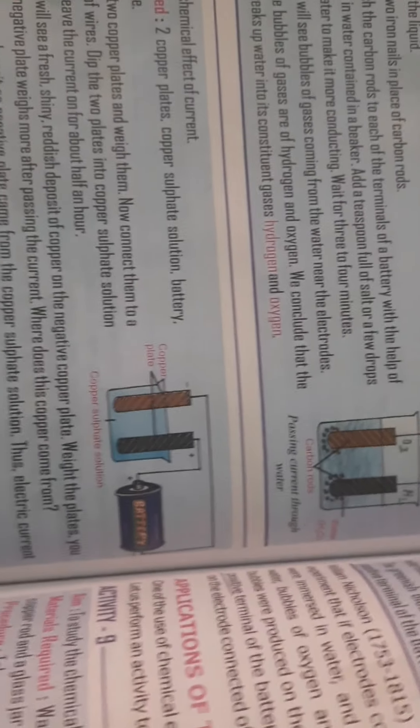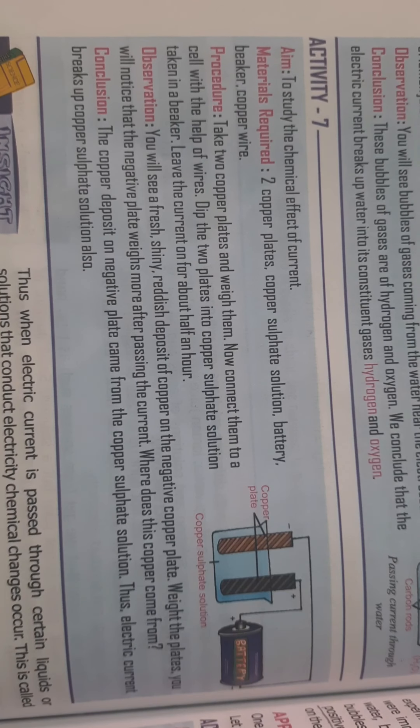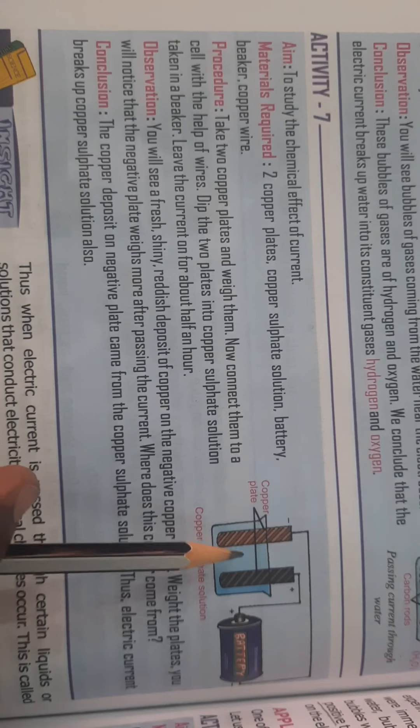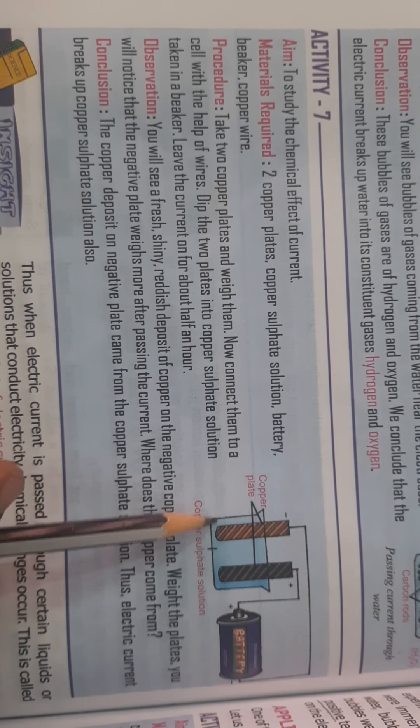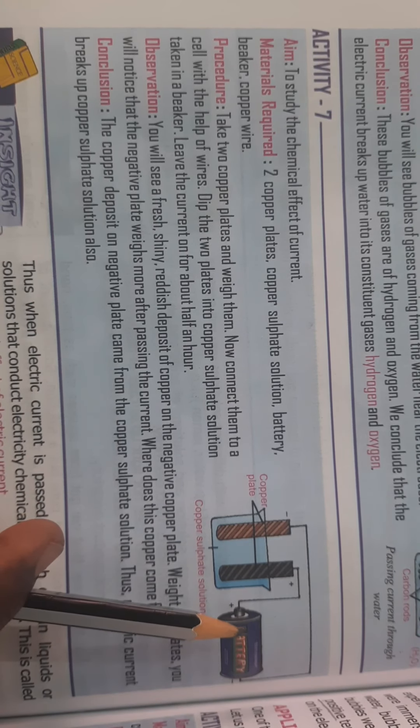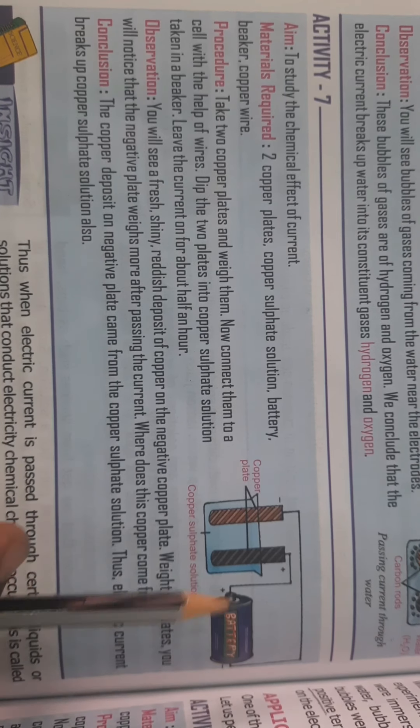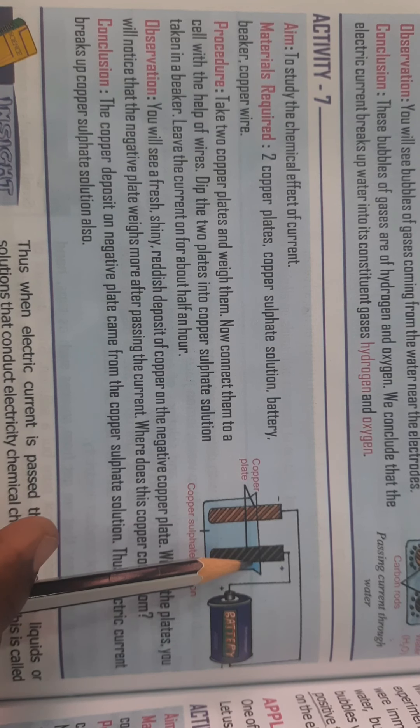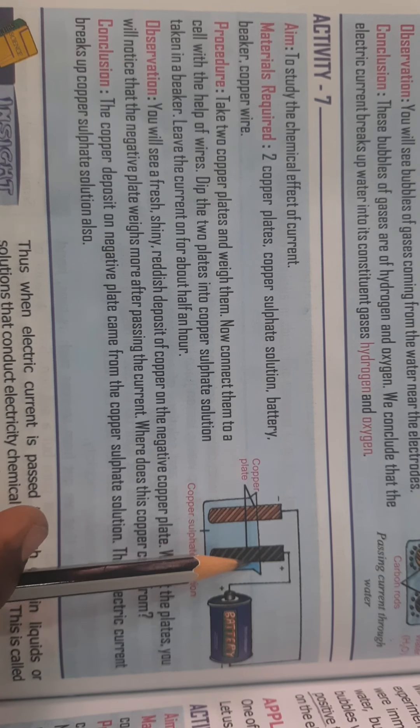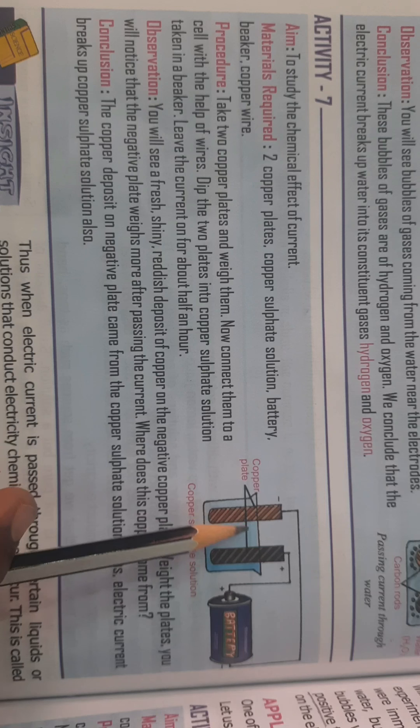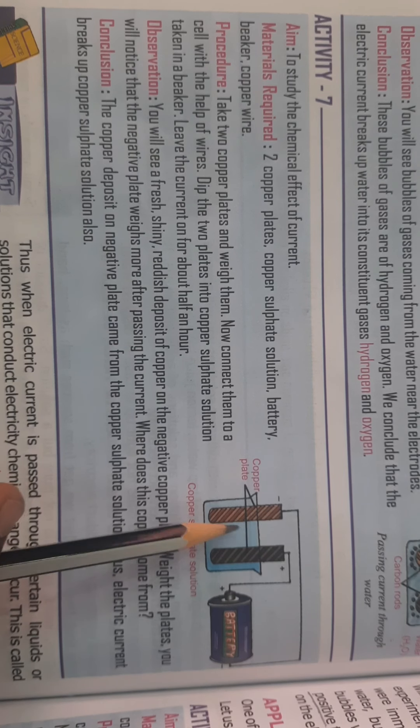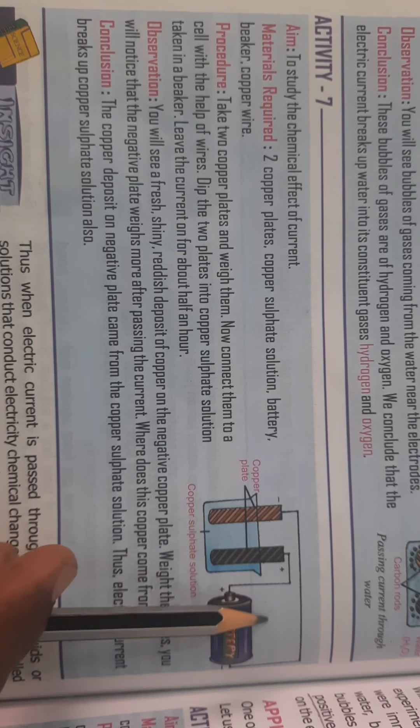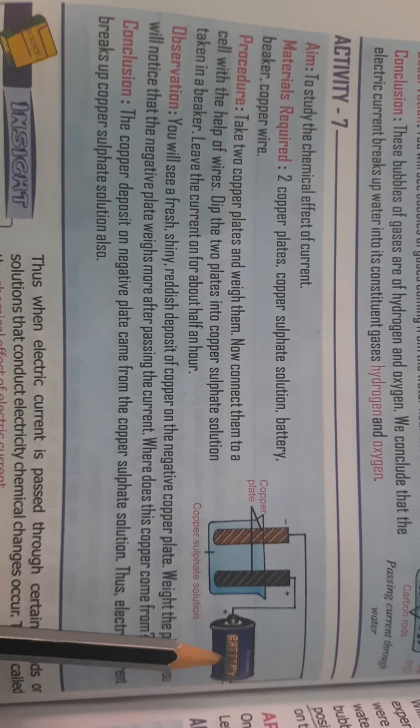Here we have got one more activity to study the chemical effect of current. You have taken two copper plates, a solution of copper sulfate, a battery and copper wire. Before putting the copper plates into the copper sulfate solution, you have to weigh them. After weighing them, dip them in the copper sulfate solution and leave this whole apparatus for half an hour.